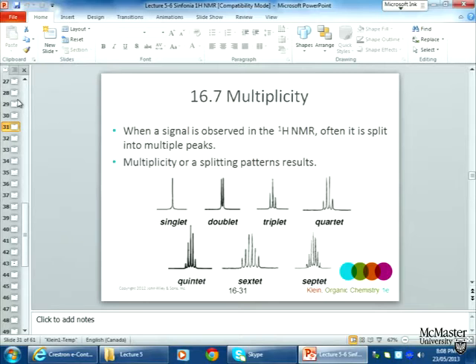So proton NMR helps us learn about the types of protons in a molecule. And in proton NMR, once more, not only do we learn about the environment of the protons, but we can do integration so that we can find out how many protons there are in a certain environment. So if we see a signal that integrates for 3 hydrogens, that suggests they are all in identical environments, that suggests a CH3 or methyl group.